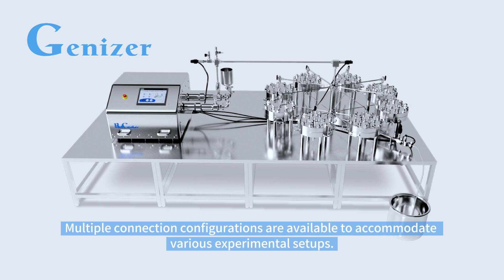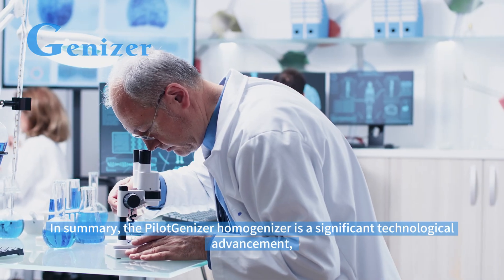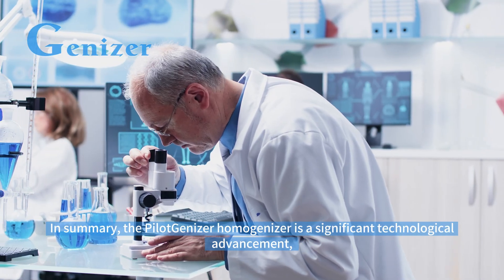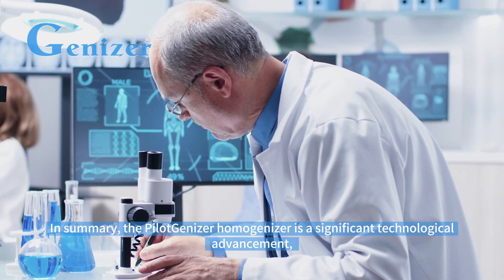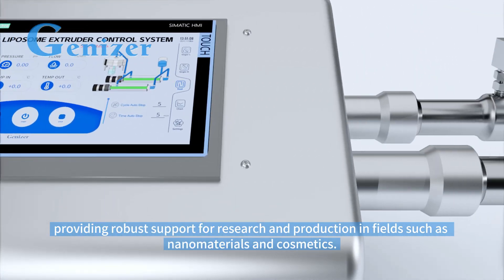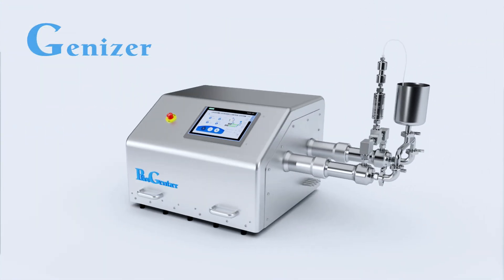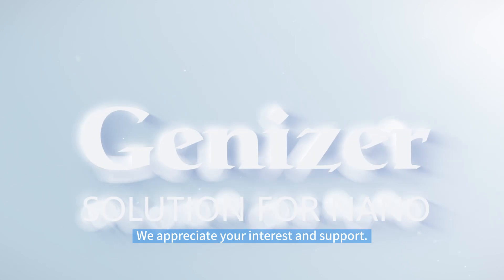Multiple connection configurations are available to accommodate various experimental setups. In summary, the PilotGenizer homogenizer is a significant technological advancement, providing robust support for research and production in fields such as nanomaterials and cosmetics. We appreciate your interest and support.